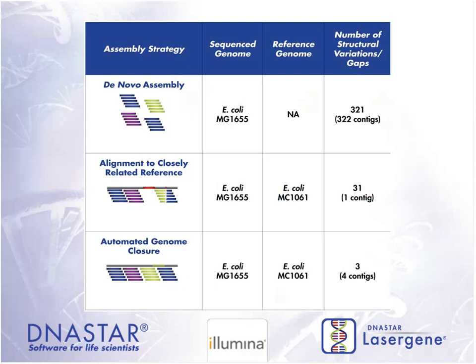Anytime that you have a microbial genome and you want to assemble it, you really have some choices to make. The choice might be, do I do a strictly de novo approach? Do I take my MiSeq data, get the longest reads possible, paired end, assemble it, get some contigs, then use the pair information to order them in scaffolds, and then try to close the gaps between the contigs? If what you've sequenced is completely novel, that's the only option that you have.